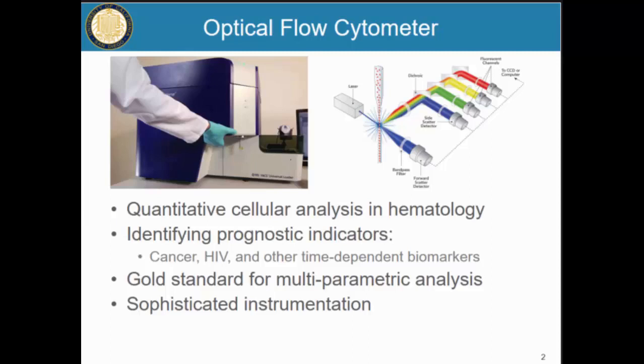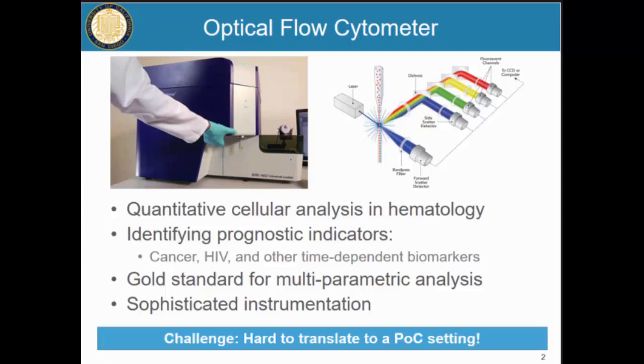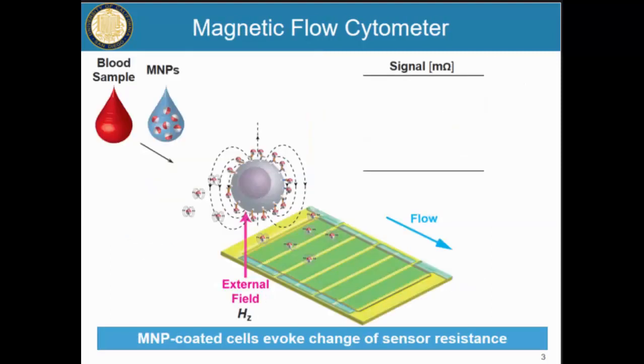It's a benchtop type device, primarily due to all of the optics and the laser and everything else that is contained within this device. And so really the work here is how do we take this device and translate it to a point of care setting where you might be able to use this outside of a traditional clinic. And so this brings us to the idea of a magnetic flow cytometer.